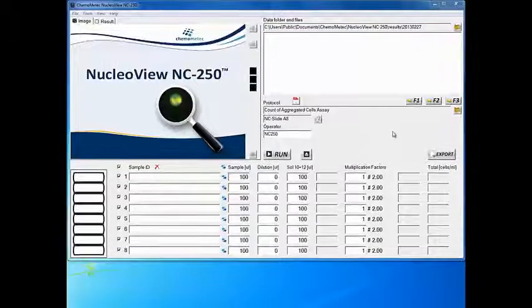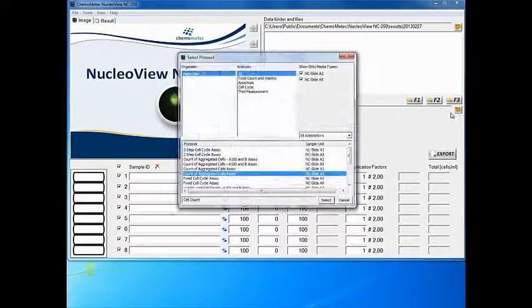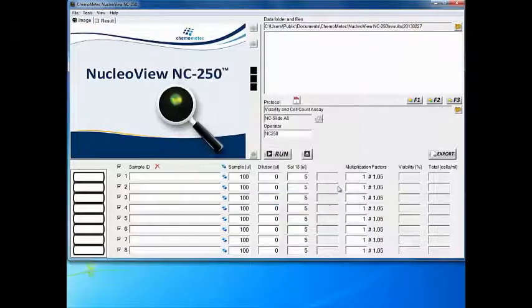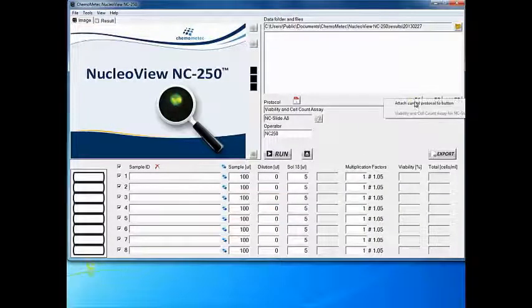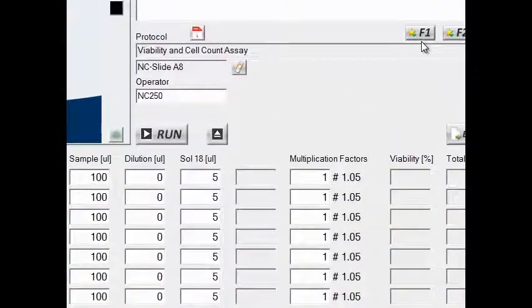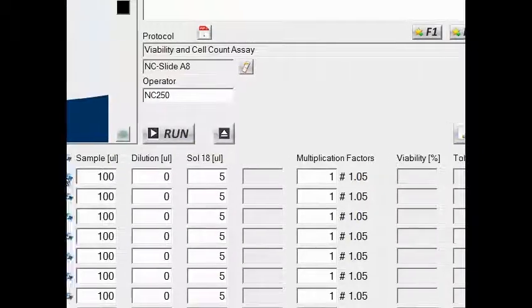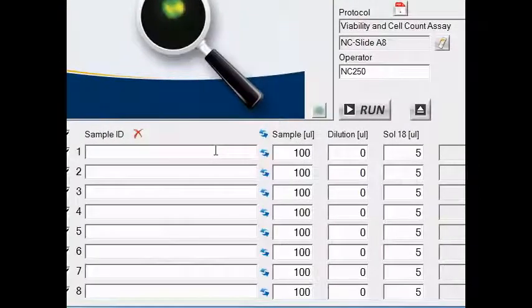To count your cells, choose the protocol in the Nuclear View software. Favorite protocols can be stored by right-clicking the fast selection buttons and attaching the current protocol to the button. If the sample has been diluted, enter the volumes used into the volume edit boxes and these will be taken into account in the result.